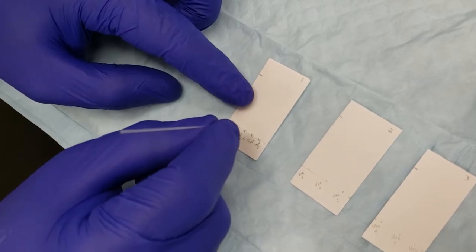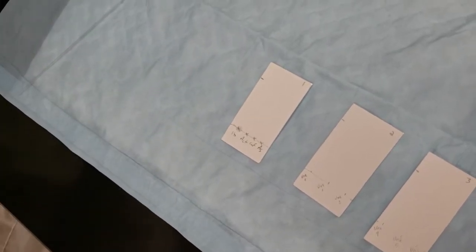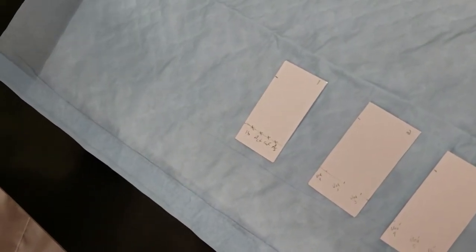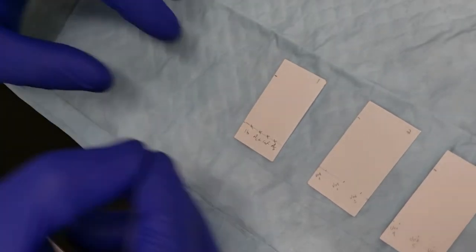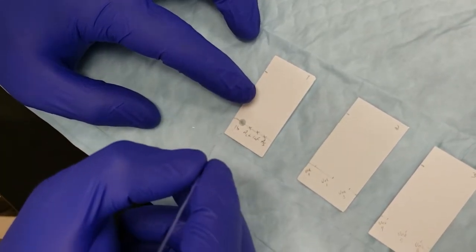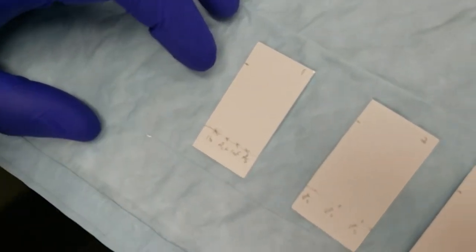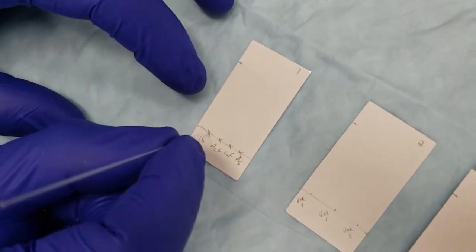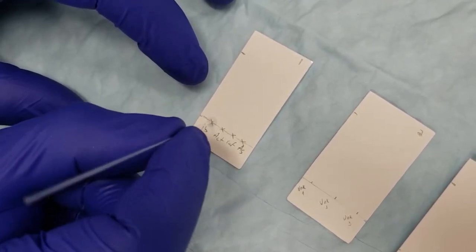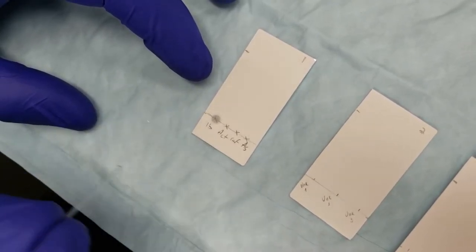Blow on the plate. And then another spot. Now with ibuprofen, it is fairly difficult to see, so we're going to spot twice. We're going to go with two capillaries full. We'll do it again. Spot. And hopefully you can see the dark circle that appears, which slowly disappears as that solvent evaporates. And I'm just blowing on it to help evaporate that solvent.